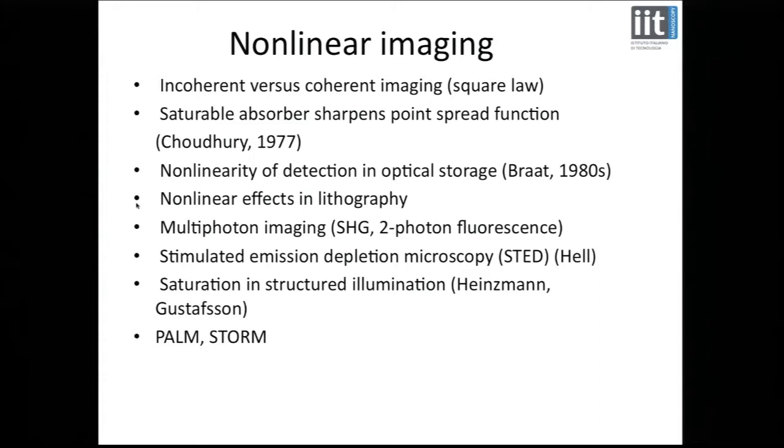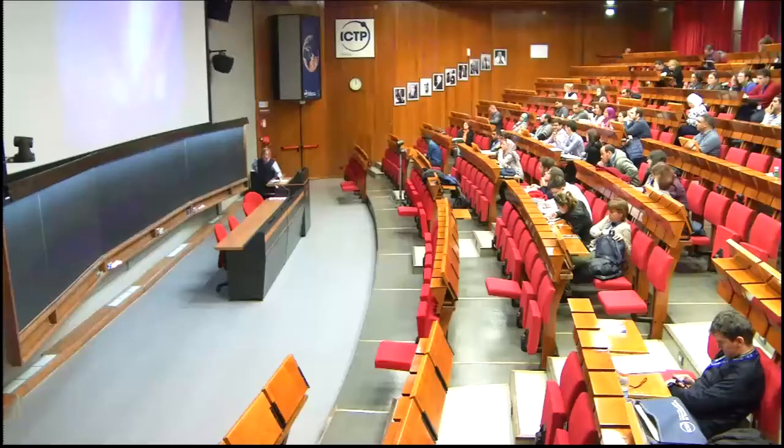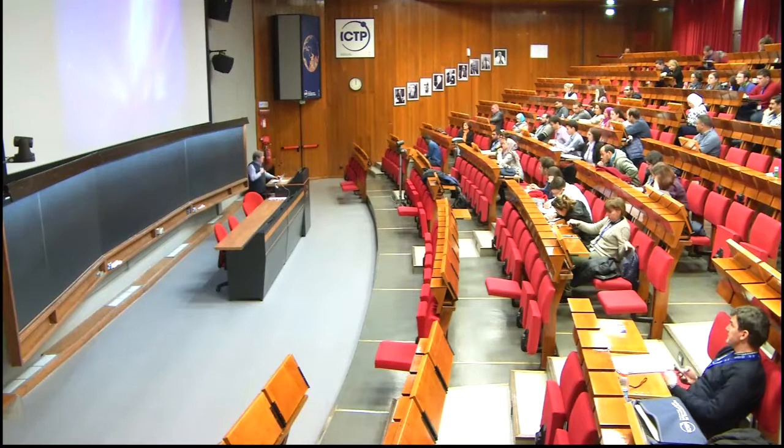Okay, so one of the conclusions I want you to make from there is that you should distinguish between true super resolution and other methods. And this is just listing some of the things. Maybe I've said enough really on this. So I think that's the last one on this talk. Any questions before I carry on to say something about phase contrast?